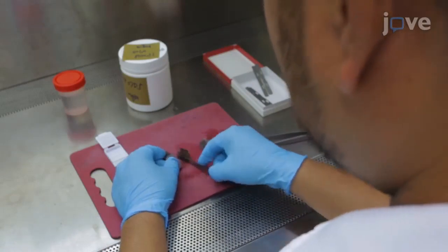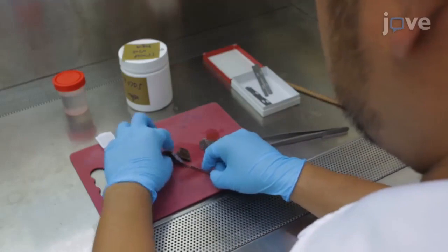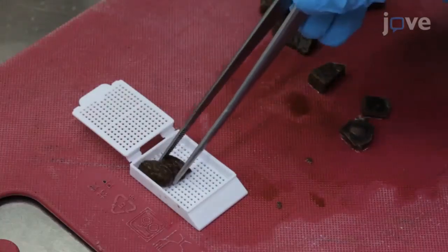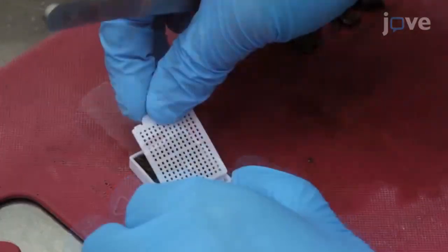Next, use disposable stainless steel microtome blades to trim the formalin-fixed liver and kidney tissues into 2 cm x 1 cm x 3 mm sections and place both liver and kidney sections from the same individual into the same labeled cassettes.